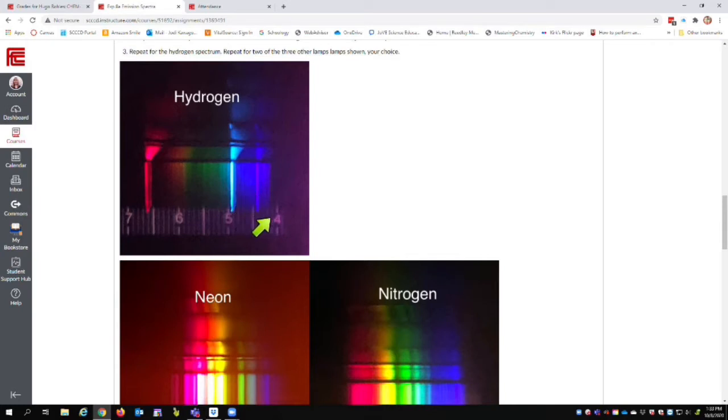And so we're going to read these off of the scale and the spectroscope as best we can and write those down. And then we're going to plug those numbers in for y in the equation for the line and solve for x. And the x value will be the corrected wavelength, which hopefully will be closer to the expected or known wavelength for hydrogen.